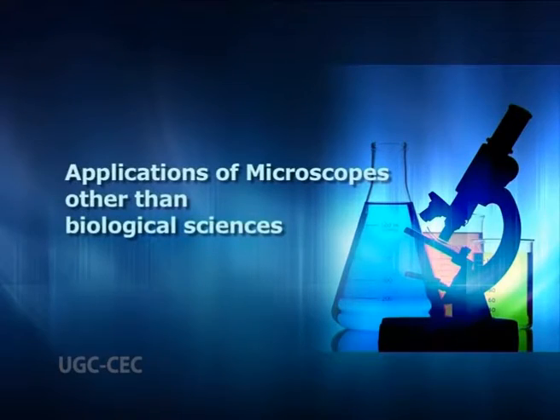Applications of microscopes other than biological sciences. In physics, to understand the size and structural topography of minute crystal matter. Chemical formulations are subjected to microscopy to know their structural particulate size, property, and nature. Material sciences, geology, and mathematics are largely dependent on preliminary data of knowing the structural configuration and particulate size of natural and or synthesized materials, either to know or match the matter structure.